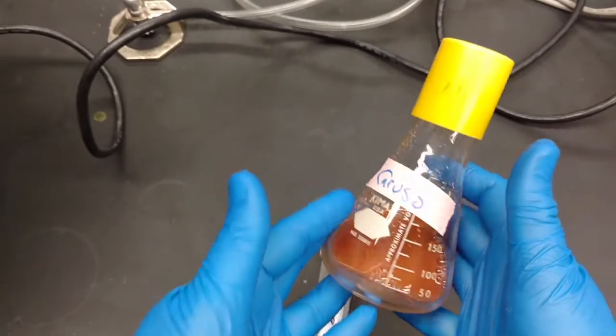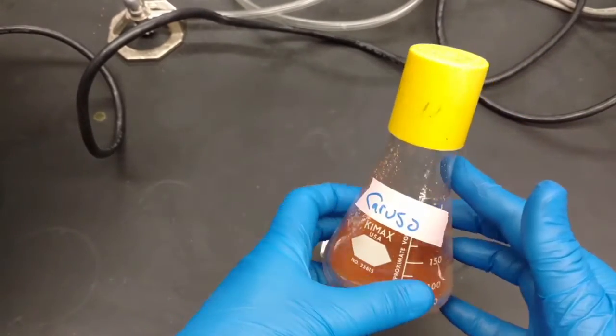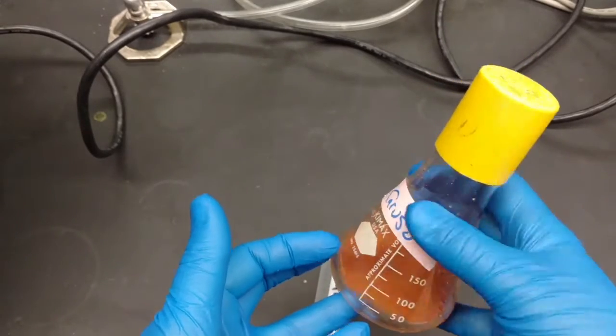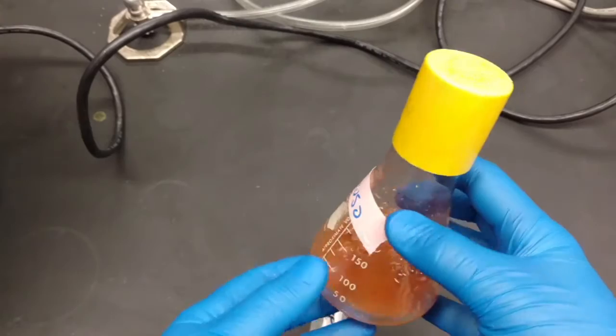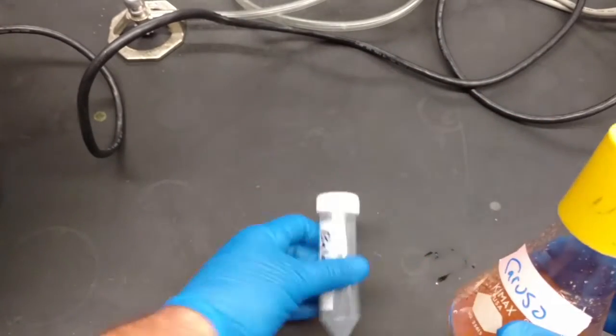Here's one that I started yesterday with some soil that was donated by a student from India, so I can't wait to see what we get from this. It's very smelly — you're going to want to wear gloves when you do this and be careful you don't spill anything.